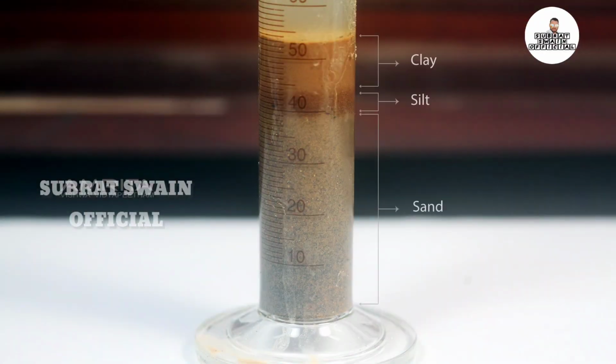Observe the thickness of the layers formed by different types of particles in the measuring cylinder. The thickness of clay particles in measuring cylinder is 17%, silt particles is 9%, and sand particles is 74%.